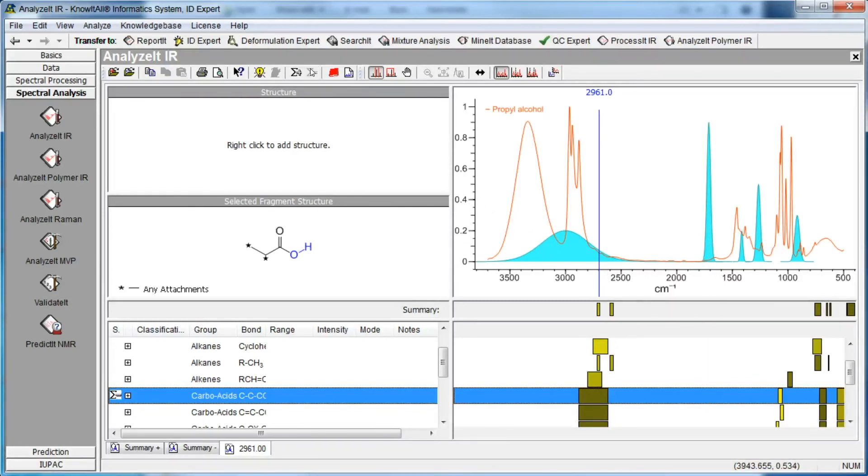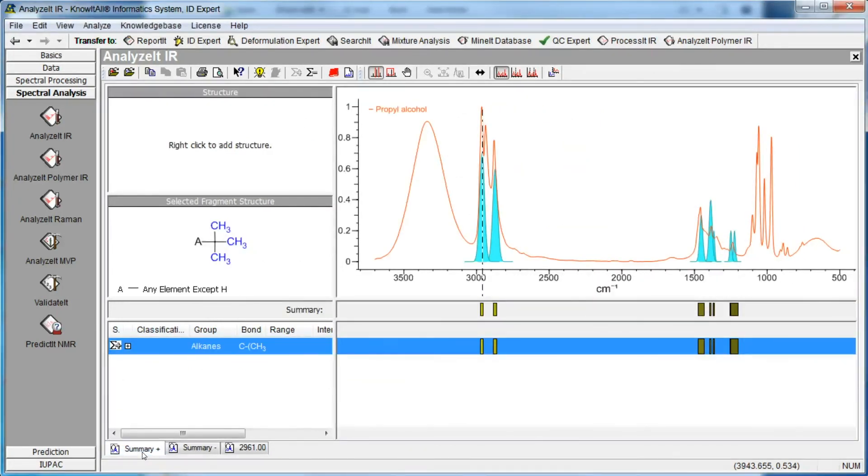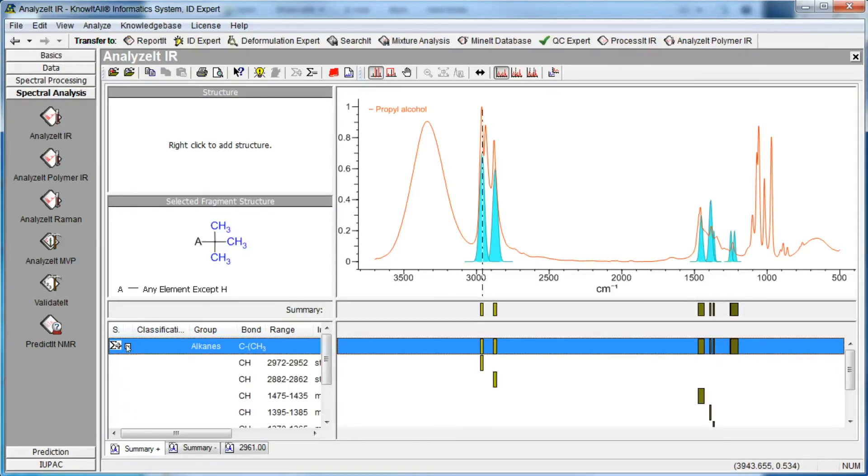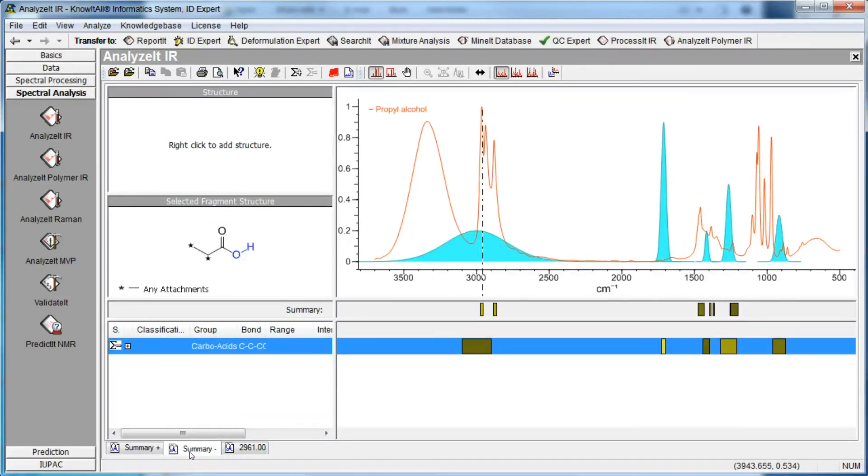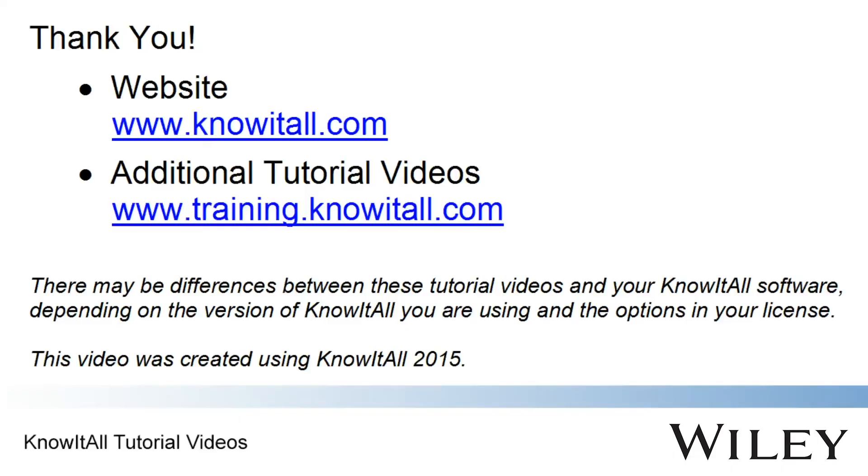You can click each tab name to view the contents. This concludes our demonstration of how to perform a basic analysis of IR and Raman spectra in the Know-It-All informatics system.